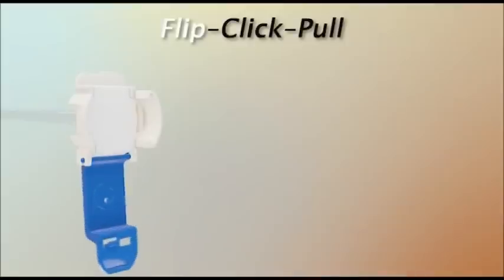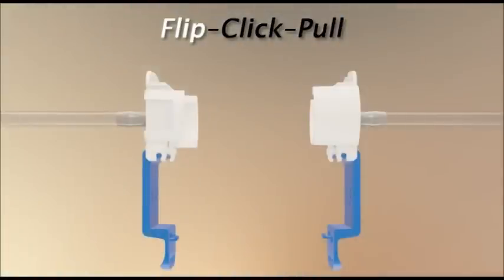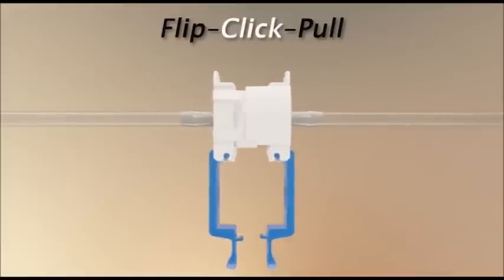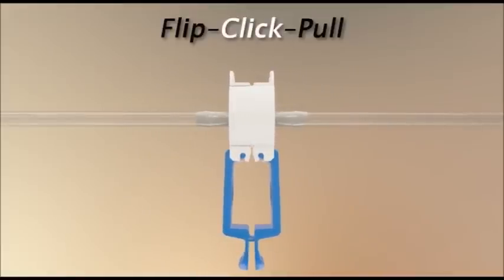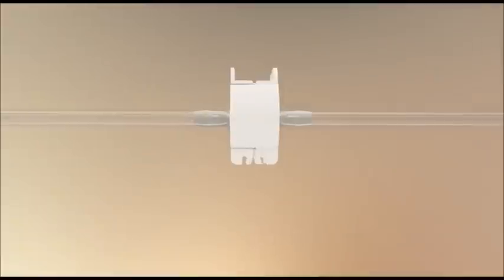Unsnap and flip down the protective pull-tab cover on each connector half. Align the connector halves with the pull-tab covers hanging down. Click the two halves together until confirmed by the Colder click. To complete the connection, simply snap the pull-tab covers together by pushing on the CPC logos, then pull the membranes from the connector.